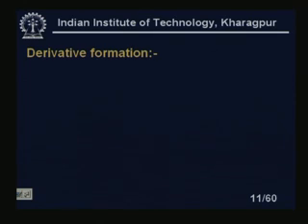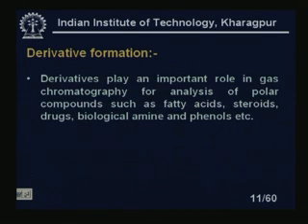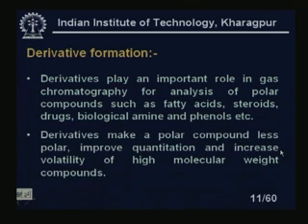Now, derivative formation. Derivatives play an important role in gas chromatography for the analysis of polar compounds such as fatty acids, steroids, drugs, biological amines and phenols, etc. Derivatives make a polar compound less polar, improve quantitation, and increase the volatility of high molecular weight compounds.